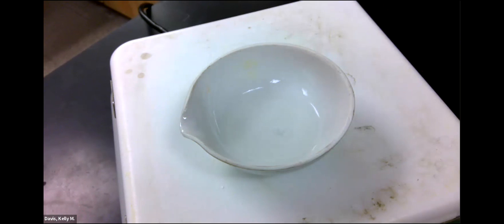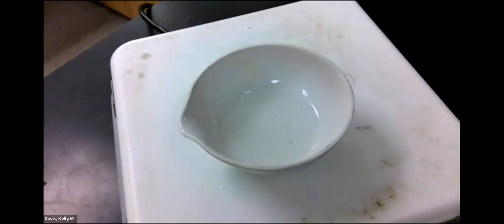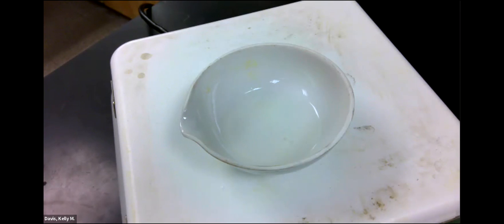And what we want is for all of the water to evaporate and boil off so that we're left with just solid magnesium chloride salt. I'm going to pause again just because it'll just be easier to watch.